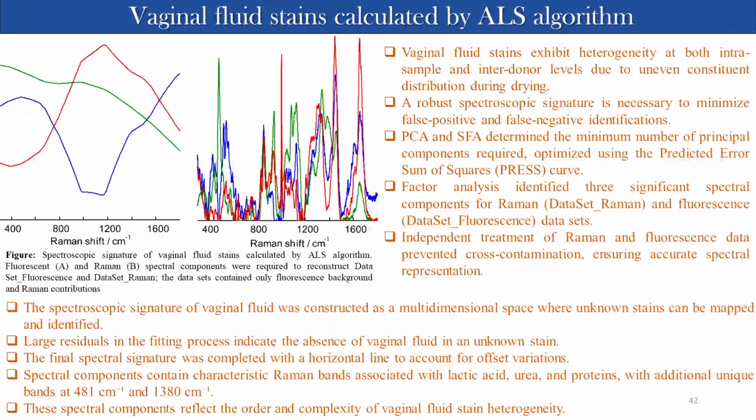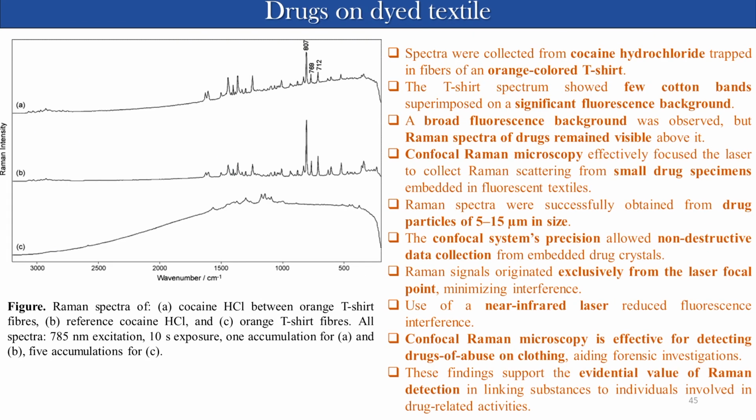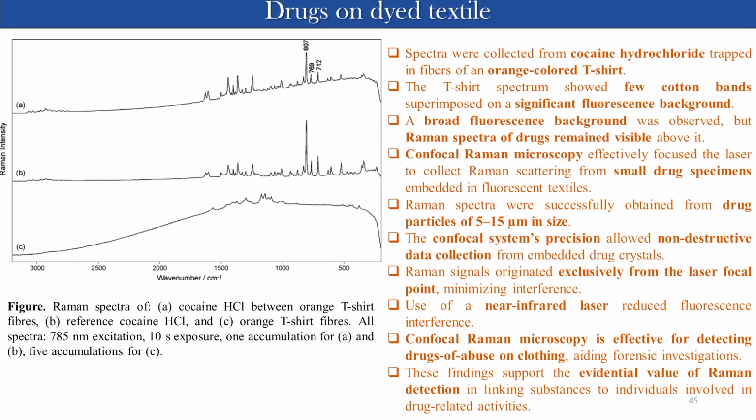Another spectrum I think I have. This is also, you see the fluorescence background. This kind of fluorescence background is not at all a good spectrum. But after many corrections, you will see that a nice spectrum comes. So this is with background, without background. You do some corrections and then you see this one. So background correction is necessary, as Professor Hiramasu also said.